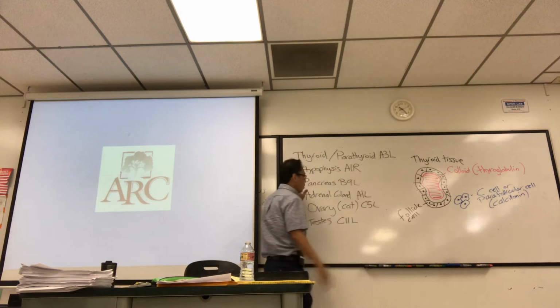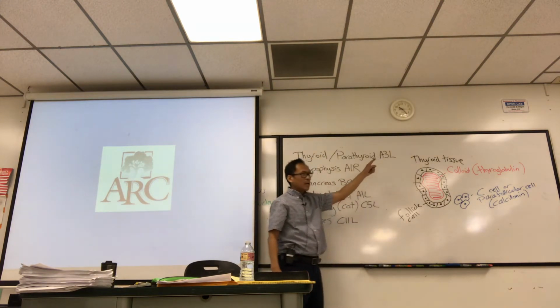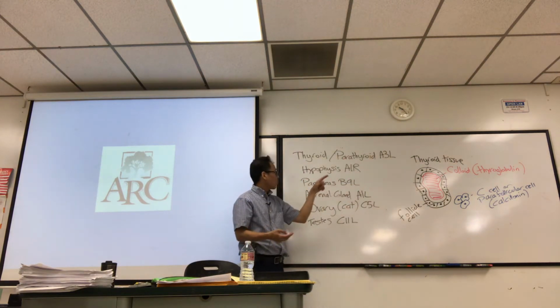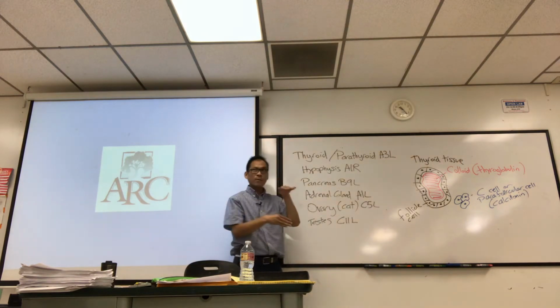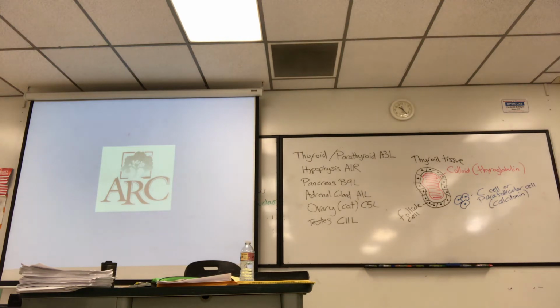Here are the slides you got to know. They're over there. And this is the location, A3L. A, B, or C, because we got 3 boxes over there. The 3, or the number, the 9, 5, that's the tray number. Got trays over here. Pull out tray 1, okay? Then when you pull out the trays, there's left and right. So that's the L and the R.